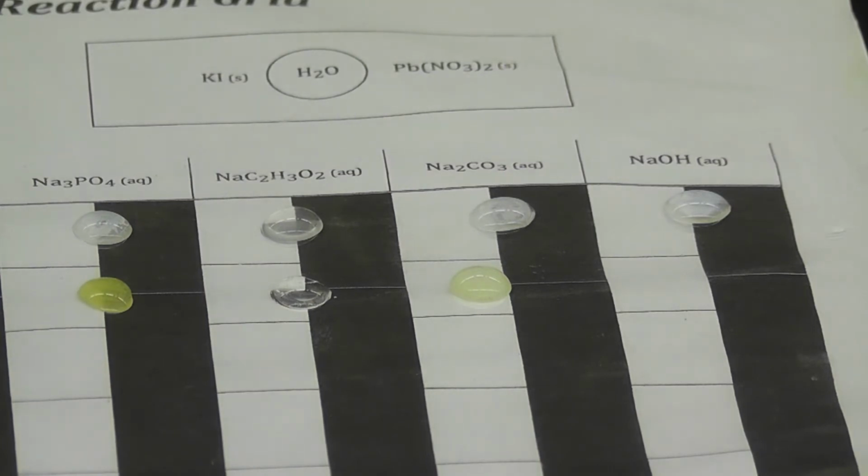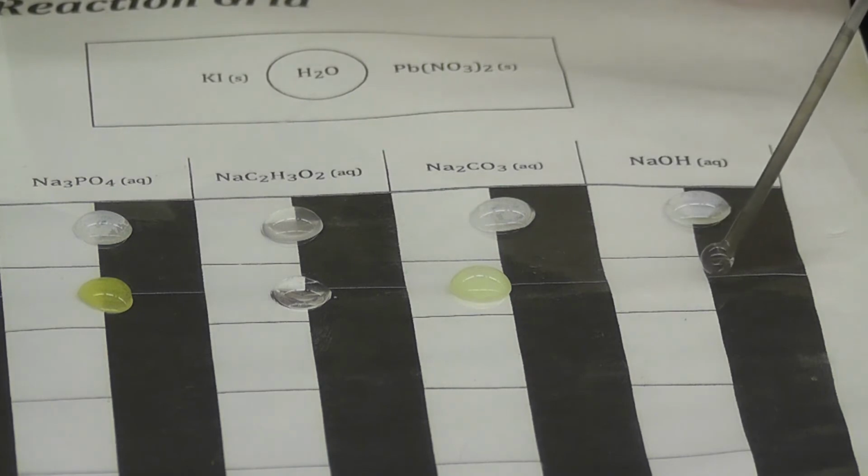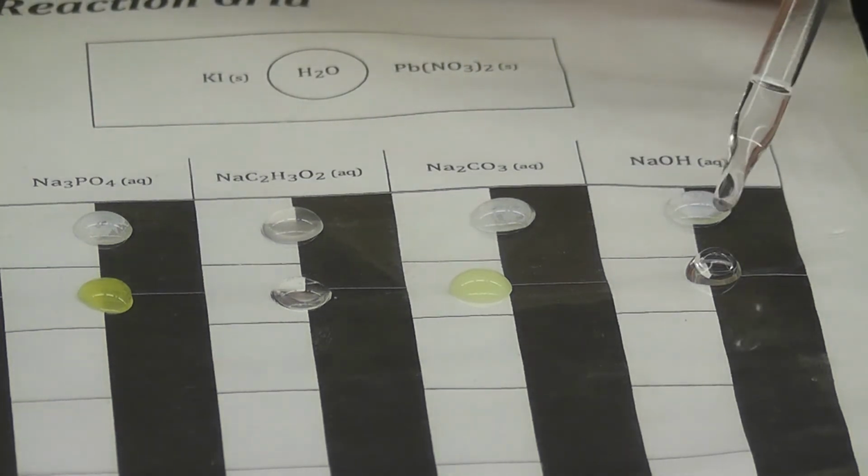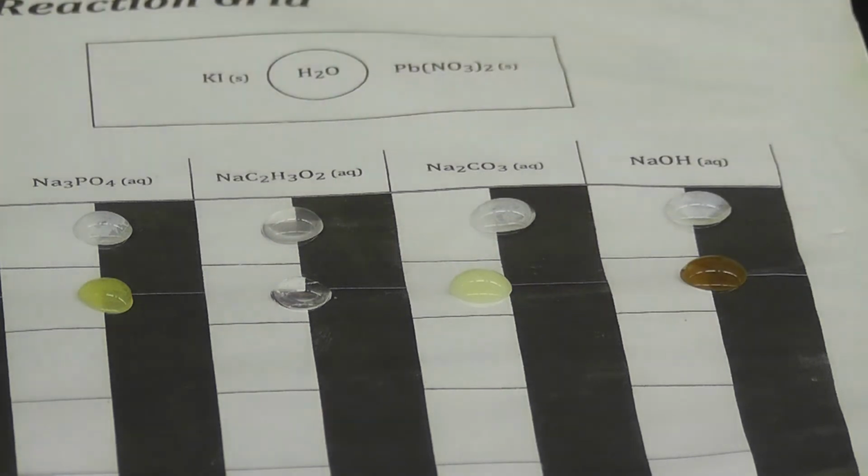Let's get this right in the middle, in between them. Okay, last one, and we're mixing this with sodium hydroxide. And 1 drop of sodium hydroxide added to this silver nitrate gives us that.